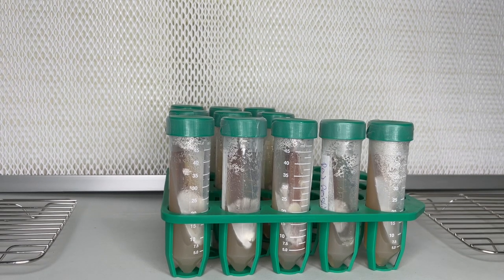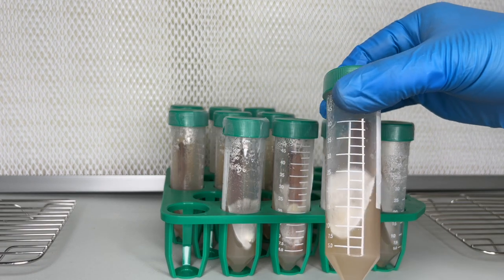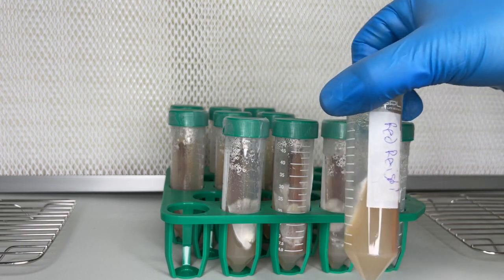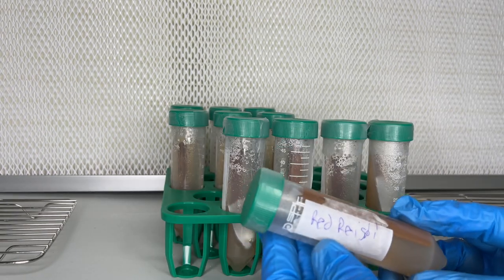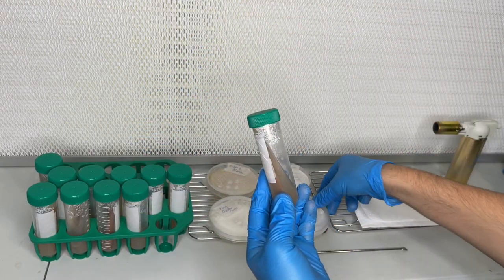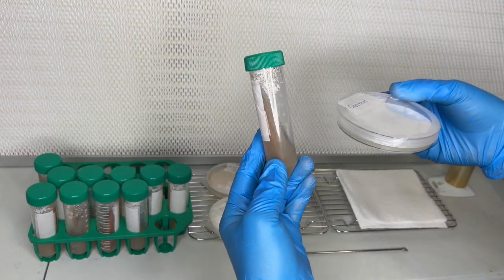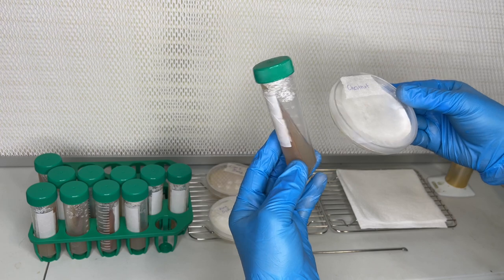In this video, I'm going to show you how to make mushroom culture slants for long-term storage. Culture slants are preferred over agar plates for long-term storage because the thick agar at the bottom helps prevent it from drying out over time.